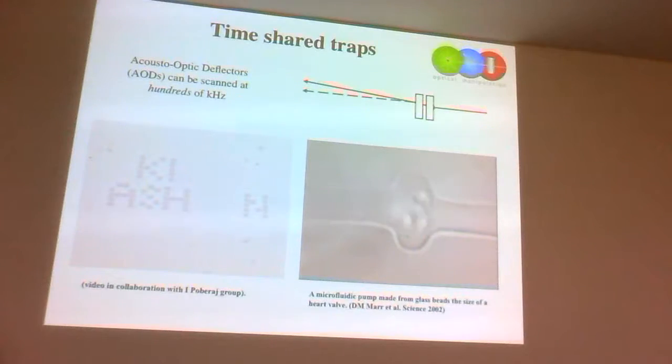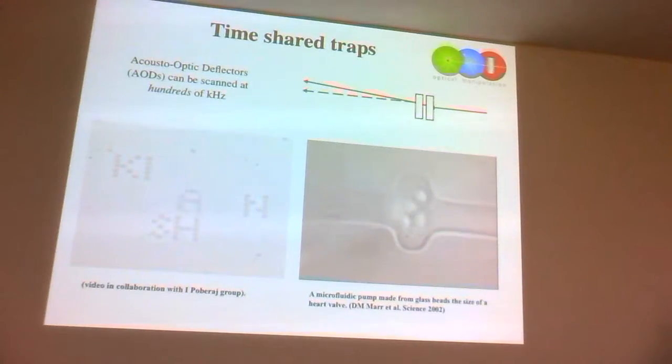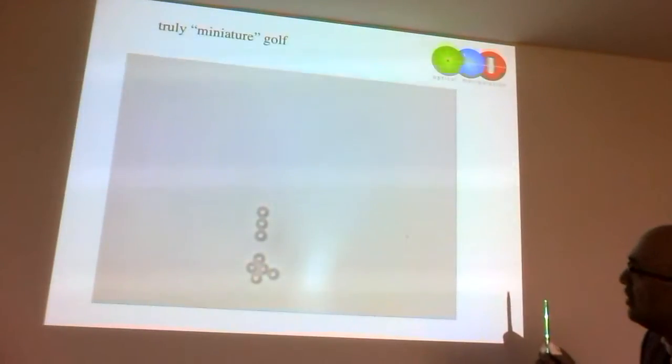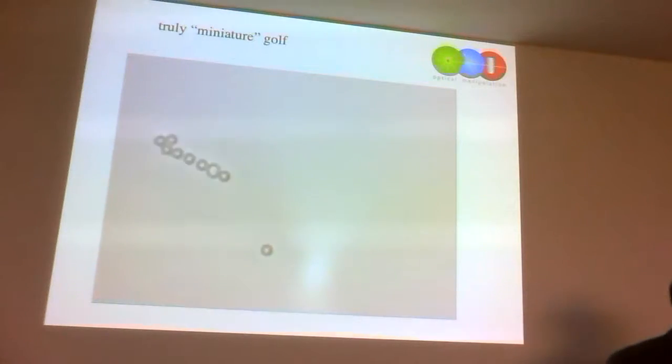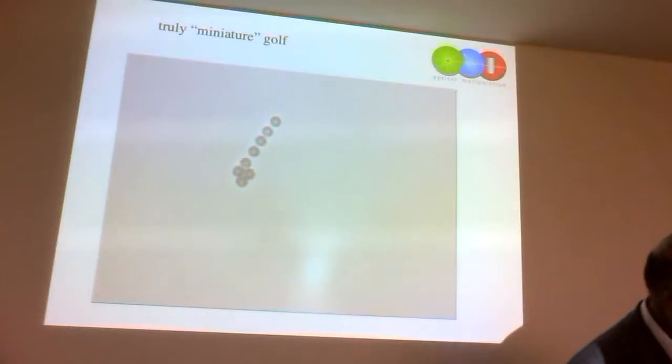It's in liquid, and if you look at the numbers, an acousto-optic deflector is incredibly fast. So in fact, this is a timeshare trap. Each of those beads is only transiently held before the beam comes back. This is very, very powerful, and at the moment still remains the method of choice for biologists to do single molecule assays in this field. You can even make a little golf club, and always get a hole in one, just like I never have.